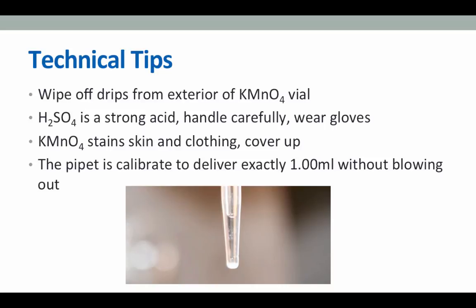As you can see in the picture here, there's a small amount of liquid remaining in the tip of this pipette. You do not want to blow out that liquid into your flask. That would add more than 1.00 mL. Okay, so let that last little drip hang there.